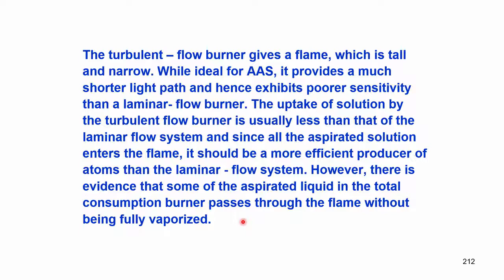The uptake of solution also in the turbulent burner is usually less than that of the laminar flow system, since all the aspirated solution enters the flame. It should be a more efficient producer of atoms than the laminar flow system. However, there is evidence that some of the aspirated liquid in the total consumption burner passes through the flame without getting evaporated, vaporized.